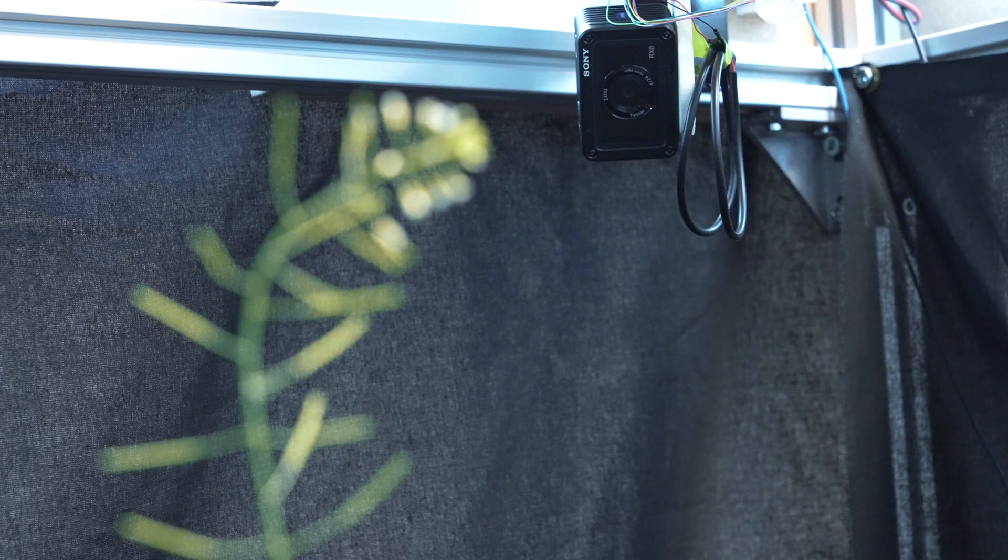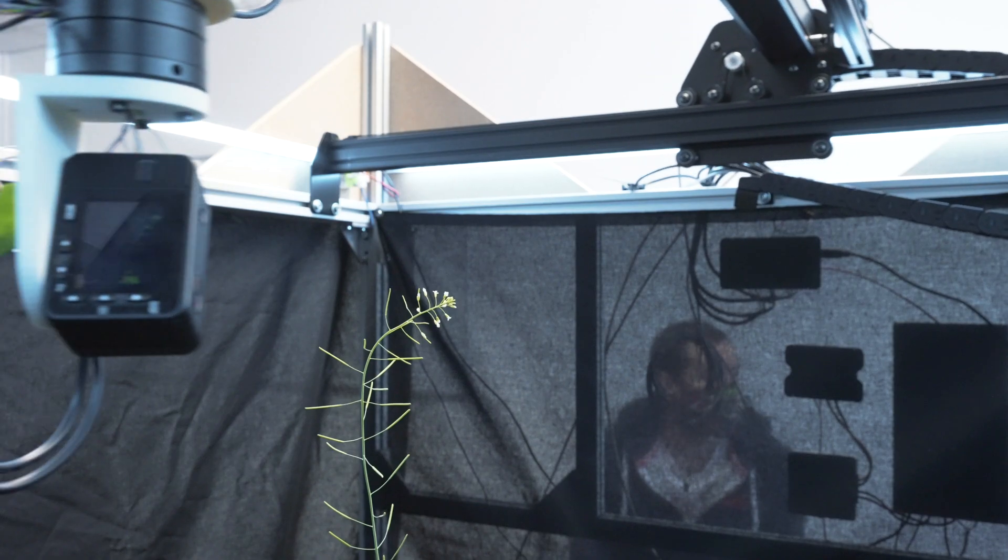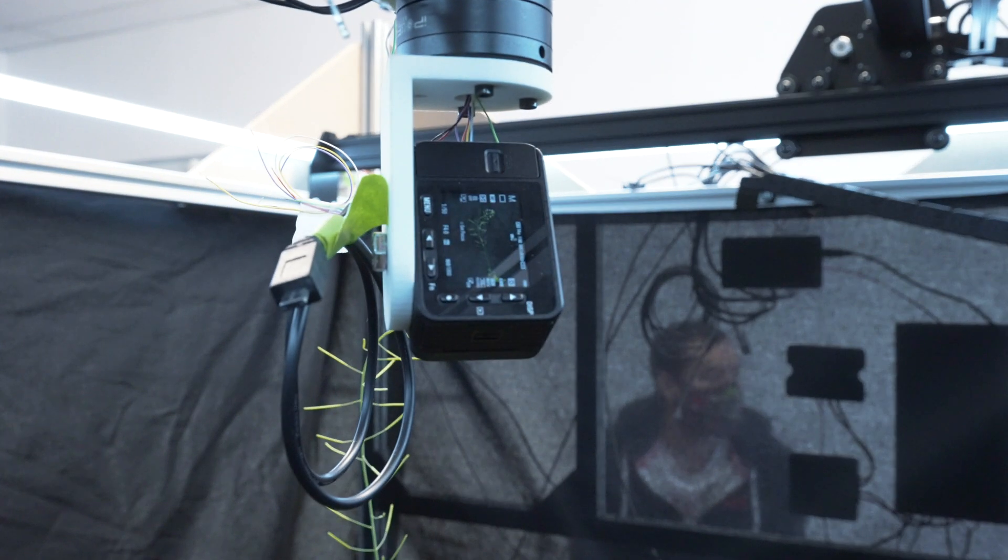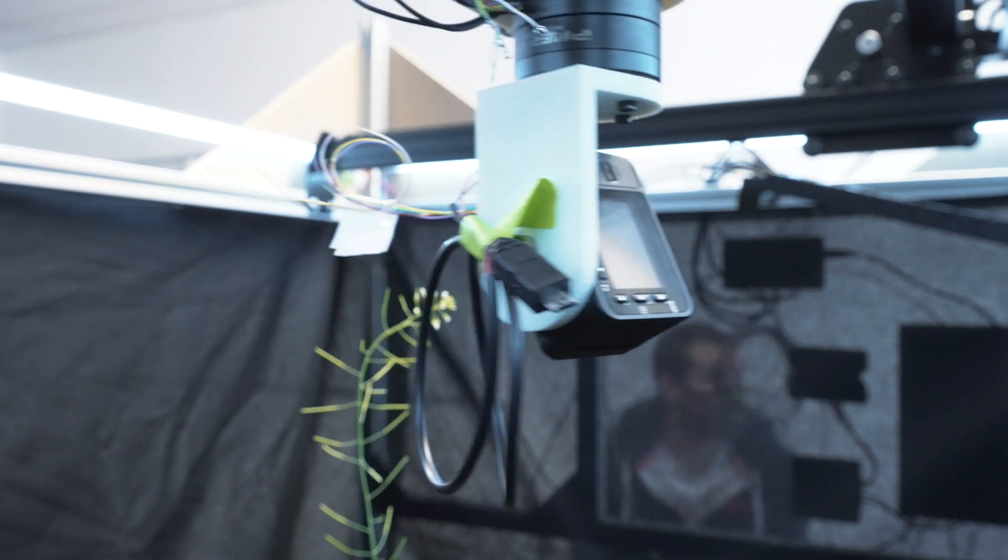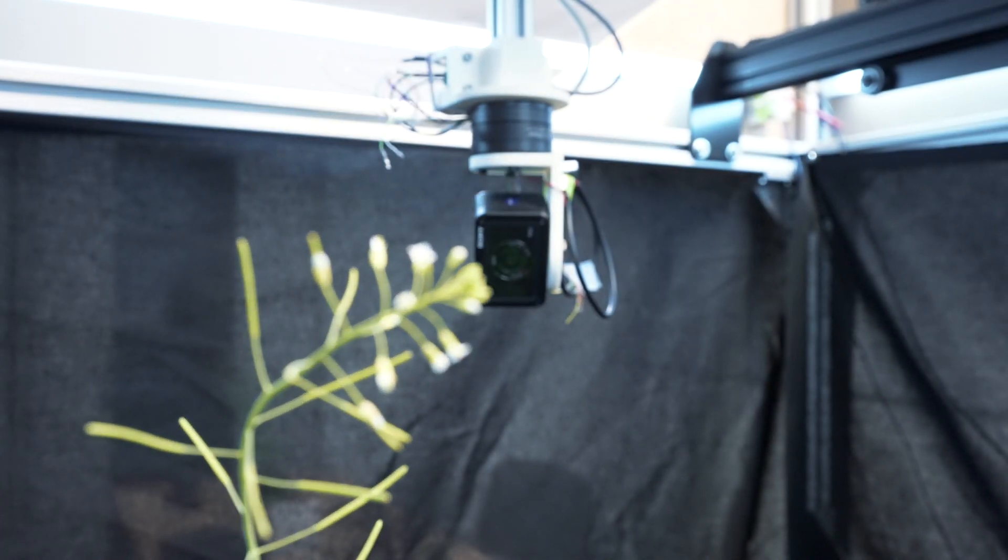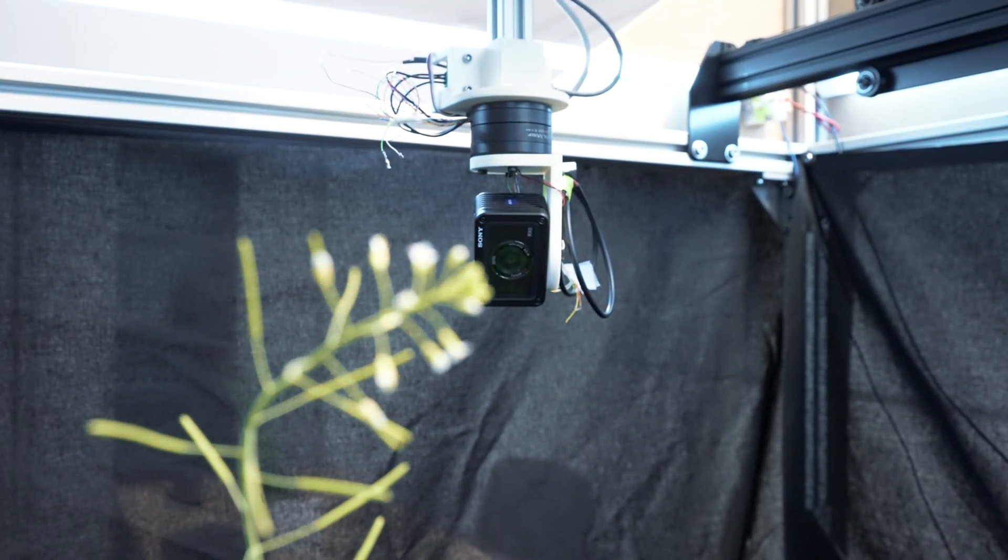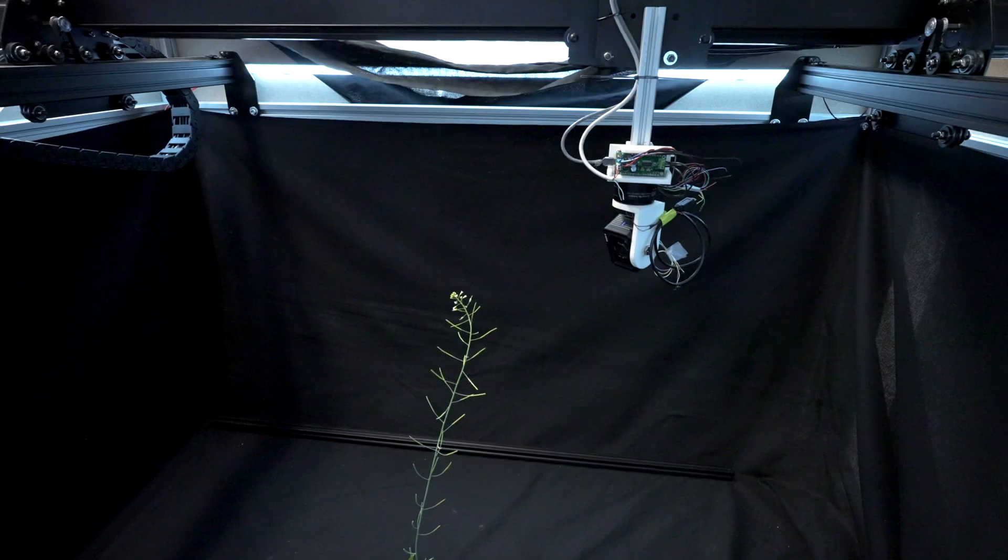The image acquisition is non-destructive, allowing lifetime analysis of the same plant or the option to reuse a plant imaged in the plant scanner in multiple analyses.